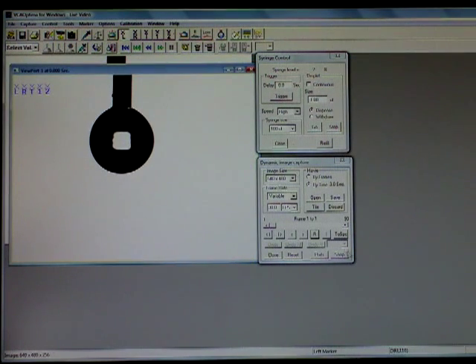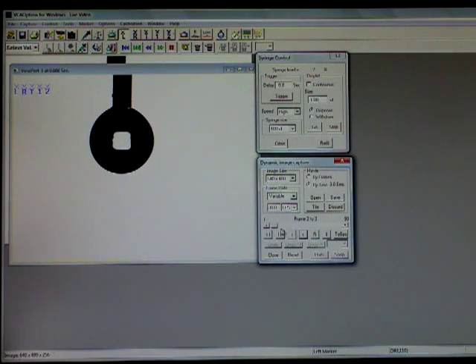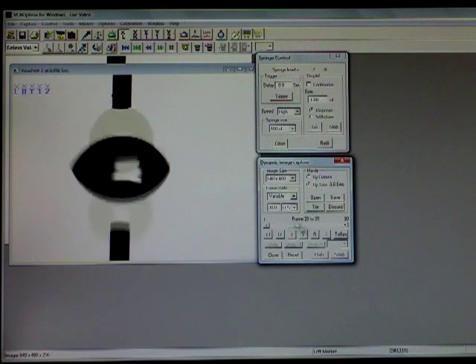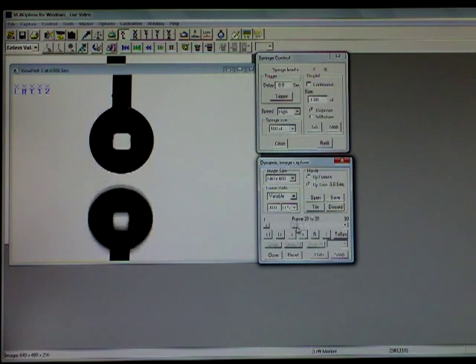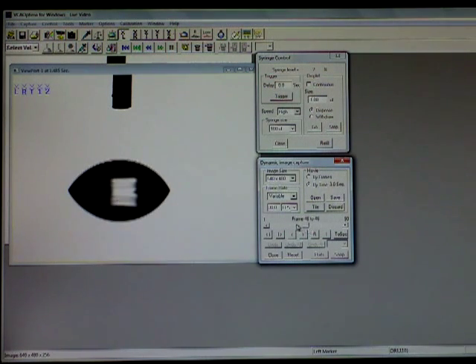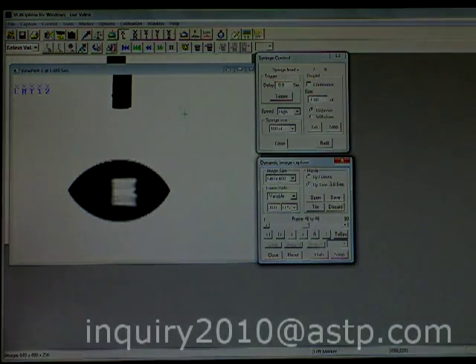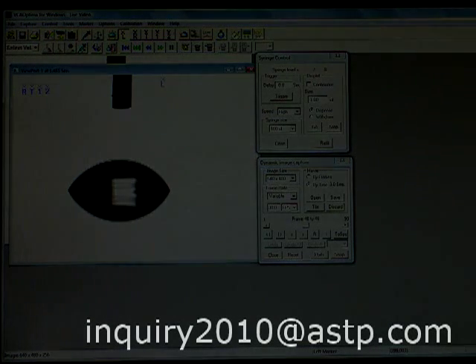You can then play the video back, fast forward it, rewind it, and you can also stop it at any point and take the contact angle.